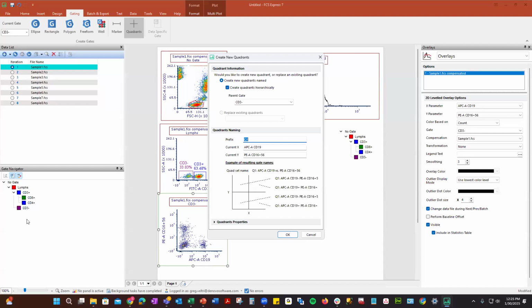It can get a little cumbersome sometimes. So we allow you to have the choice of showing it or not showing it. But for today, I'll show it. Then I have my naming. So what we did here is, this is how it's going to look presently when I do my naming. Well, I kind of want to clean it up a little bit.